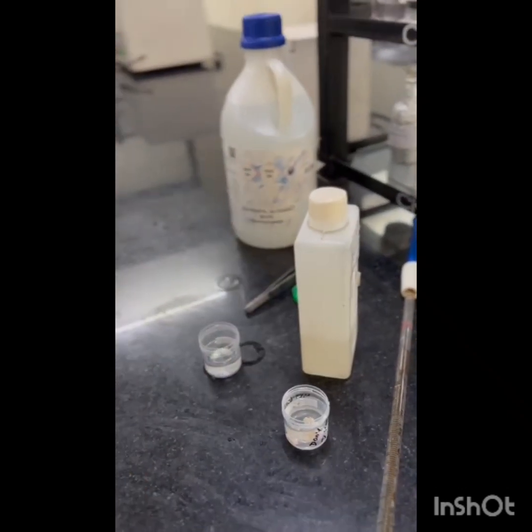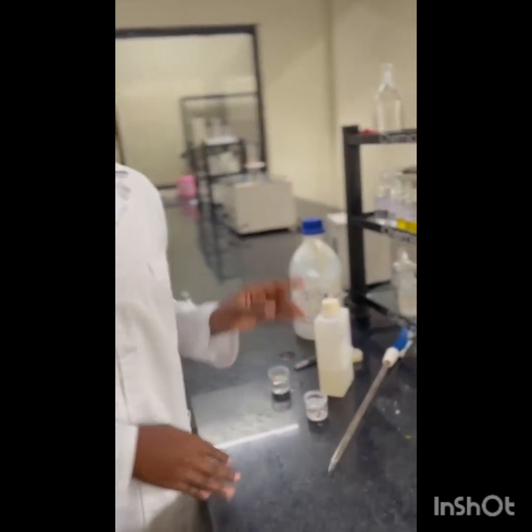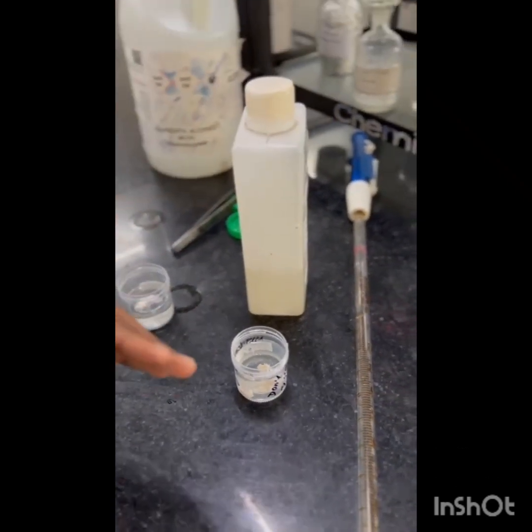Then you leave it. This is not a bone tissue. This is not a tooth. This is not something that has calcium in it. It's just for the sake of showing you that this is how it's done. So you leave it. For this method, it takes 3 to 7 days for it to complete. So it's one of the long processes, and you use it according to how much time you have.